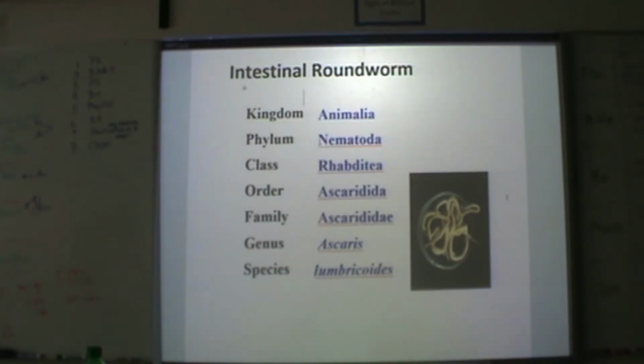And then there will be the going through the roundworm dissection, and your video will ask you whether you had a male or a female, which you think, how do you tell in worms? But you'll see that it's actually very, very obvious in the roundworms whether you have a male or female. And you don't have to answer whether you had a male or female, because you will see both. They're going to show you the anatomy of both of them.